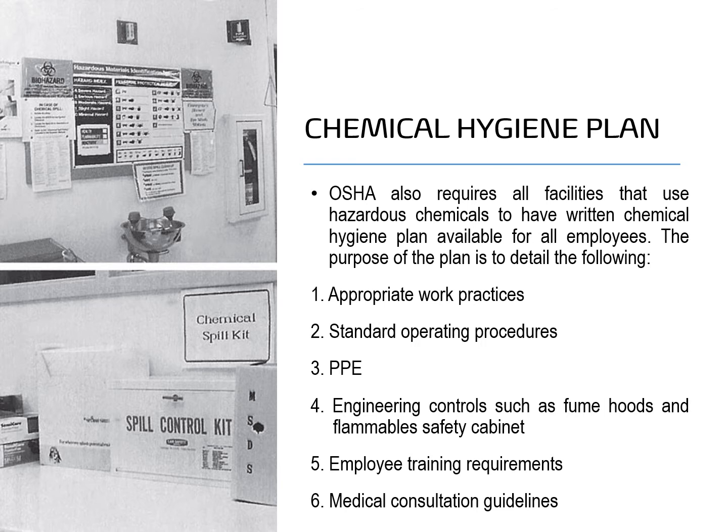Number one, we have appropriate work practices. Number two, standard operating procedures. Number three, the proper wearing of personal protective equipment. Number four, engineering controls such as fume hoods and flammable safety cabinet, employee training requirements, and lastly, medical consultation guidelines.